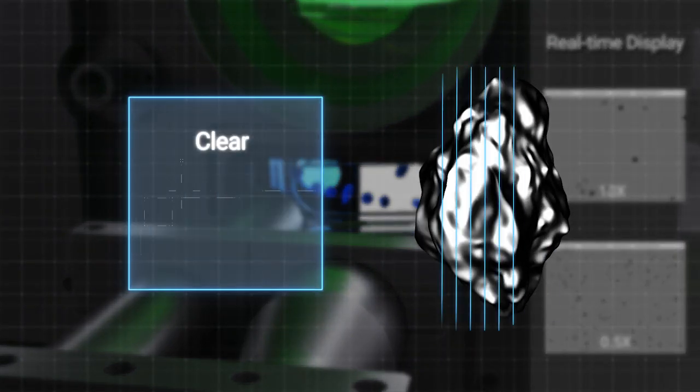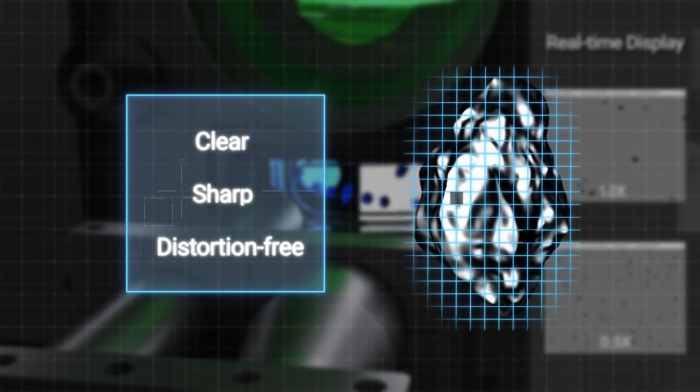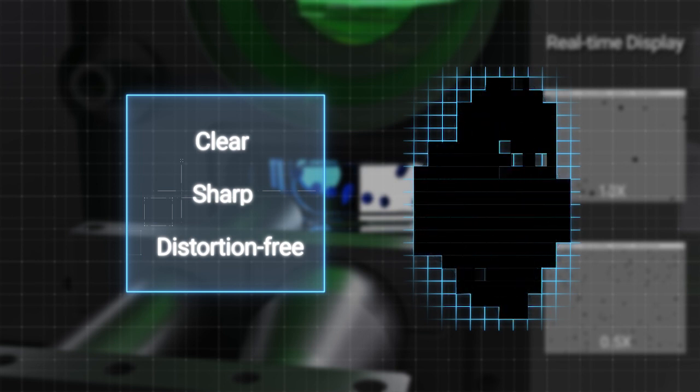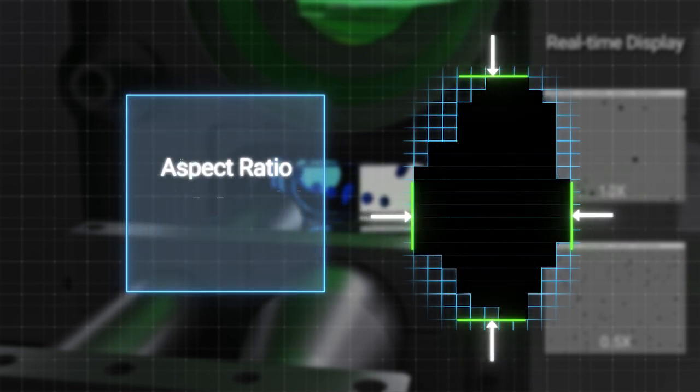Look how clear, sharp and distortion-free these particle images are. The most important and commonly used morphology parameters such as aspect ratio, circularity and others can be easily acquired with this method.